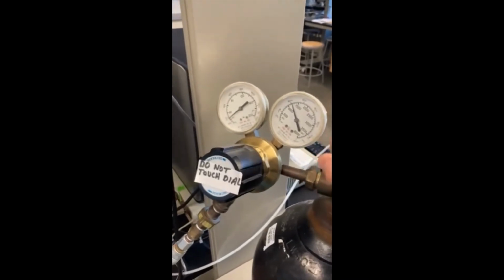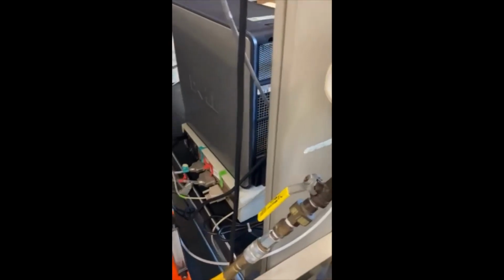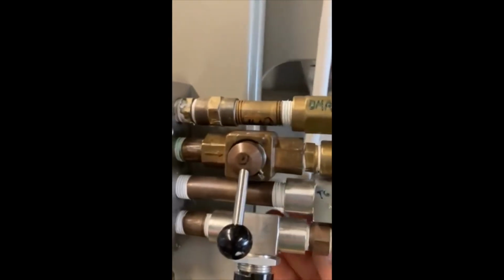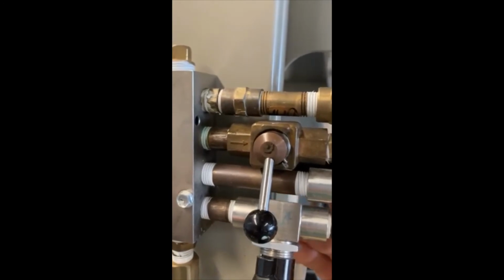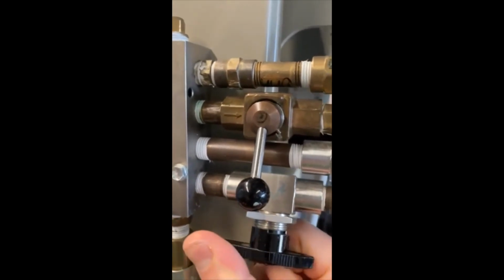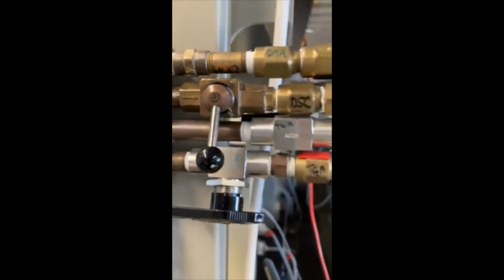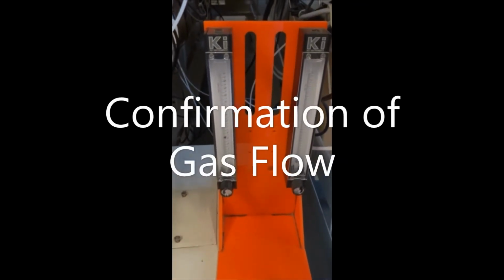To ensure that argon is flowing, we open all the valves between the argon tank and the TGA itself. We confirm the gas flow by inspecting a gas flow meter that's set up in series with the gas line to the TGA. In the video, note the raised bead in the left flow meter. This indicates argon gas flow to the TGA.